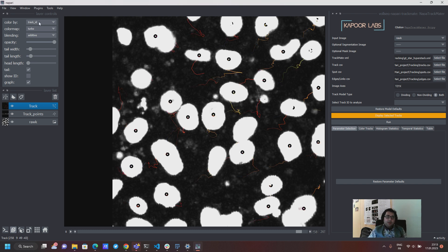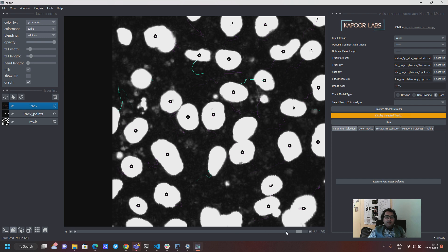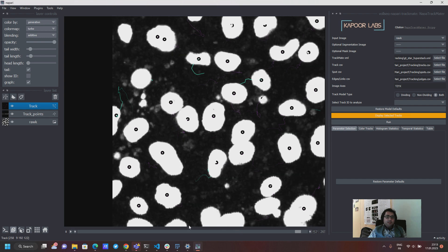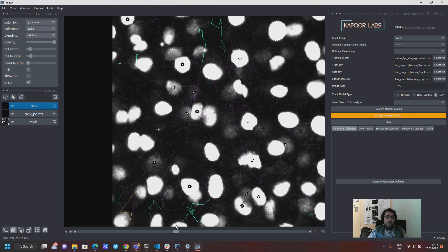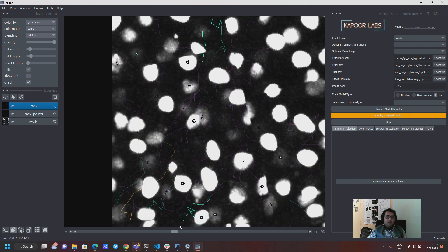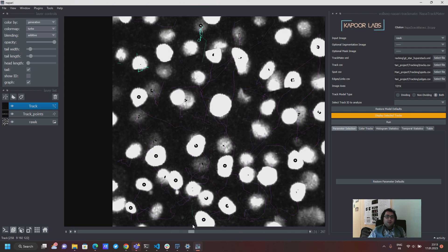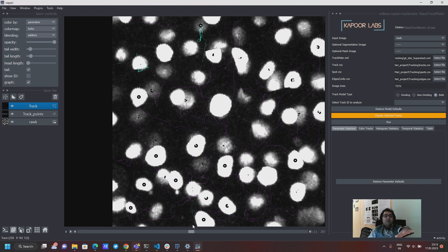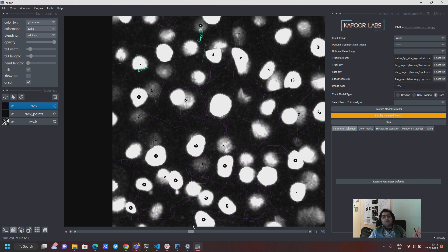And now the cool thing is that if I choose generation I can very quickly see, so let's go to the middle time point. I could very quickly see that these purple colors are generation zero so they are non-dividing tracks mostly.